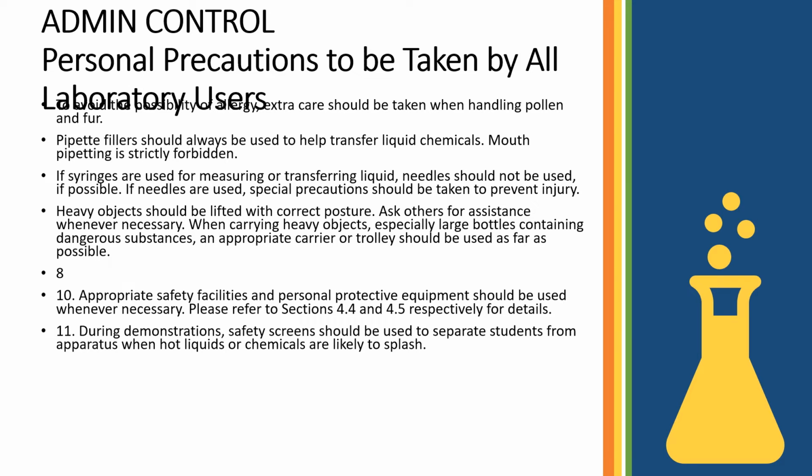Admin control, personal precautions to be taken by all laboratory users. Extra care should be taken when handling pollen and fur. Pipette fillers should always be used to help transfer liquid chemicals. Mouth pipetting is strictly forbidden. If syringes are used for measuring or transferring liquid, needles should not be used if possible. If needles are used, special precautions should be taken to prevent injury.